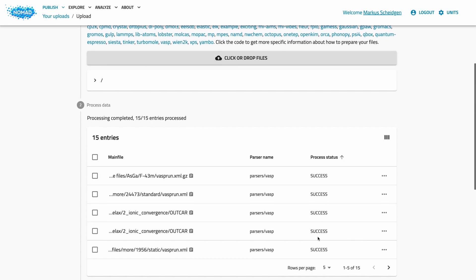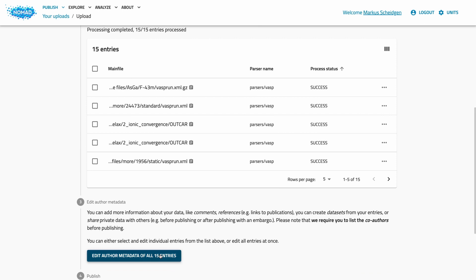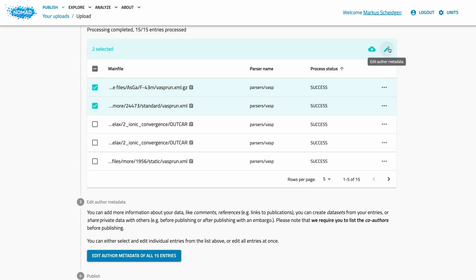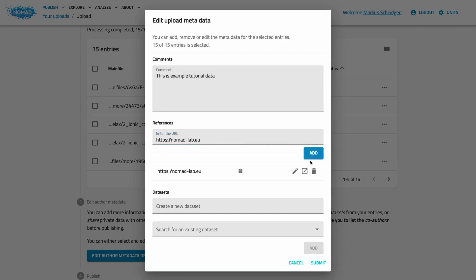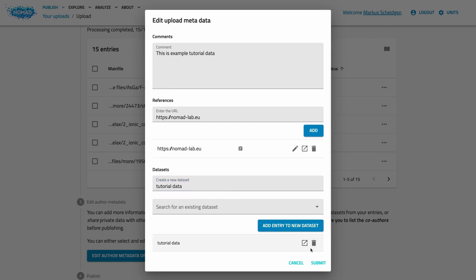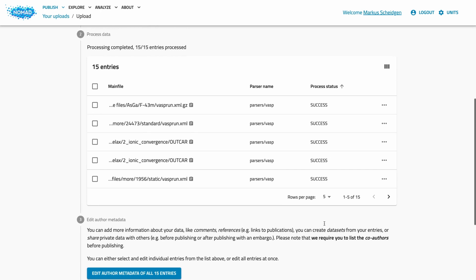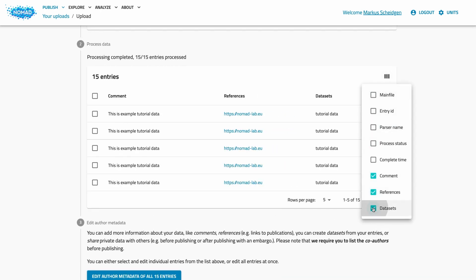Now let's have a look at the entry metadata. This button allows you to edit all entries of the whole upload. Alternatively, you can also select individual entries and edit them separately. The metadata edit dialog allows you to change the comment, add URLs as references — here you can list related publications for example — and datasets. While comments and references are strictly informative, datasets allow you to curate related data. Datasets work similar to tags, labels, or albums on other data sharing platforms. You can add entries to arbitrarily many datasets and thereby freely organize data. Datasets are also the preferred way to refer to your data, and you can create a DOI for datasets to use in your papers. You can create datasets directly in the dialog or choose from an existing dataset. If you change the columns on the entries table, you can also see the metadata, which is useful if you decide to change individual entries.